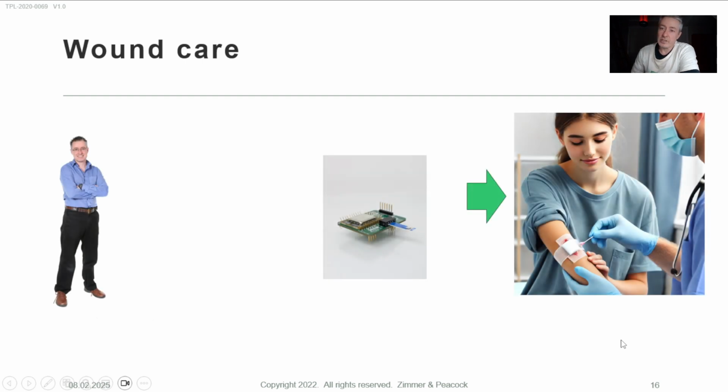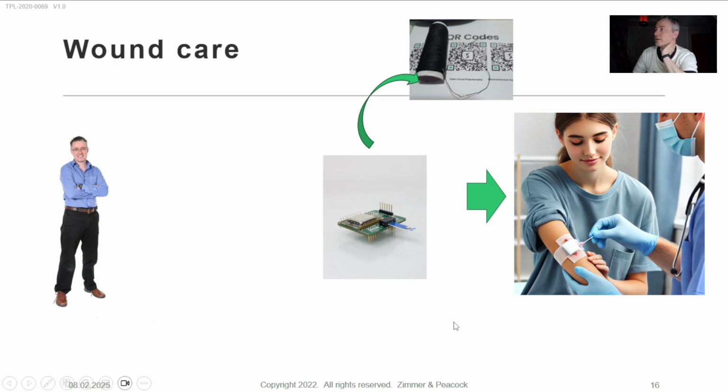So the electronics will be the same whether you're using screen printed electrode type pH sensors, which we have, or whether you've developed a new thread. The electronics are going to be the same anyway. So there's a similarity between them. The electronics won't change, so the electronics are something that you can invest in anyway, whether you go the thread route or the screen printed electrode route.